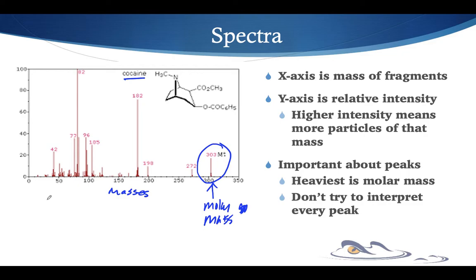But for us, untrained people, we tend to just focus on the ones that are really big and maybe try to make some sense out of those. Here's maybe my biggest, most important thing for you as a novice. Don't try to interpret every peak that's on here. If you do that, you'll drive yourself insane and you'll never be able to figure this out.